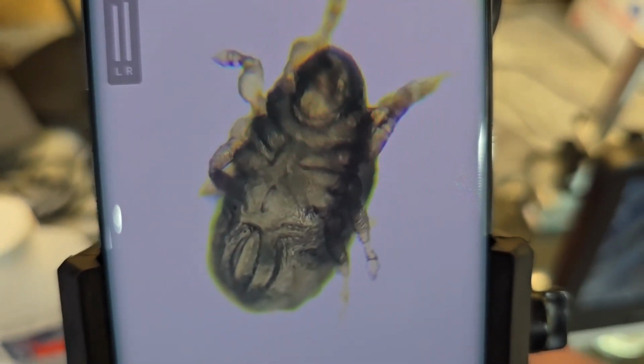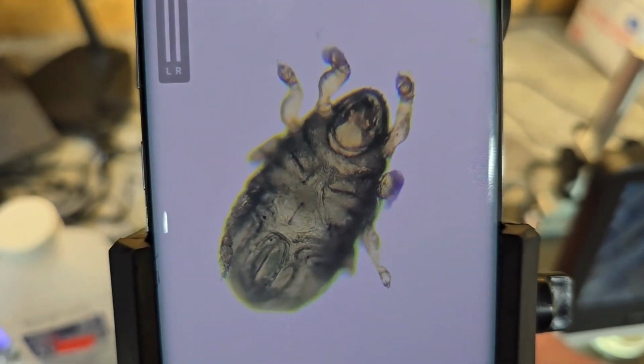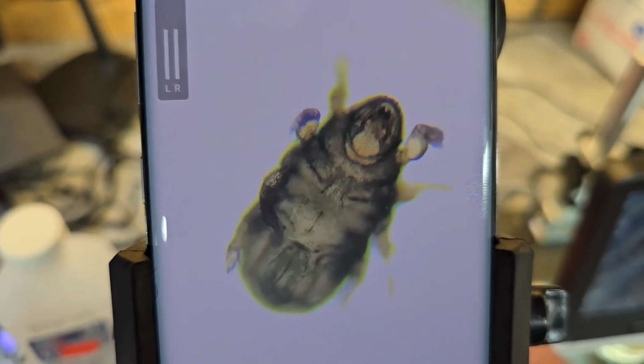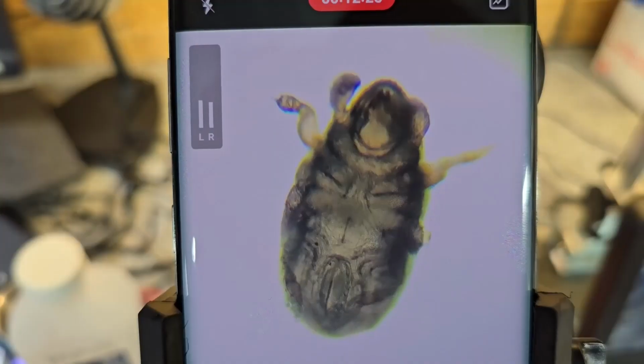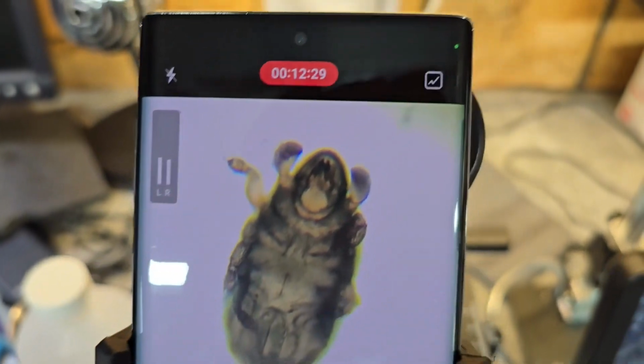I'm not sure if that's a baby tick or maybe it's just a mite of some kind. It definitely has 8 legs. Yeah, it has 8 legs for sure. There he is. He only has a face that a mother could love. Oh well.